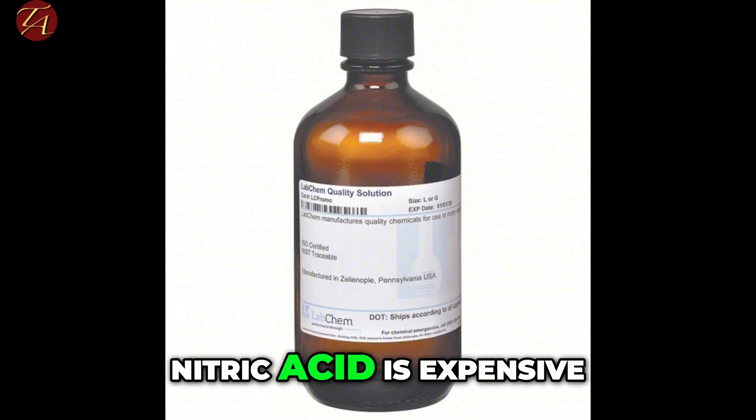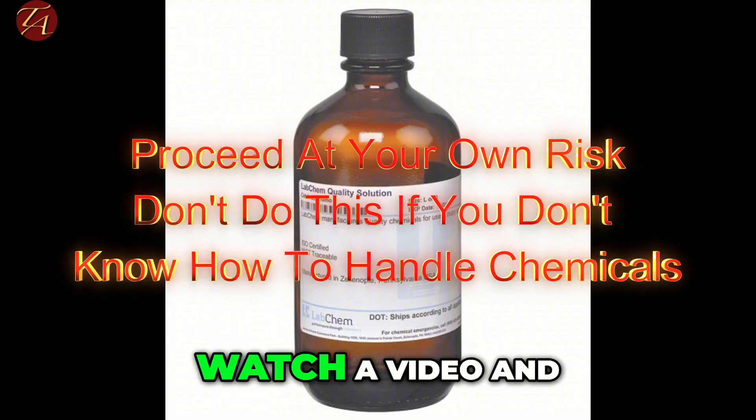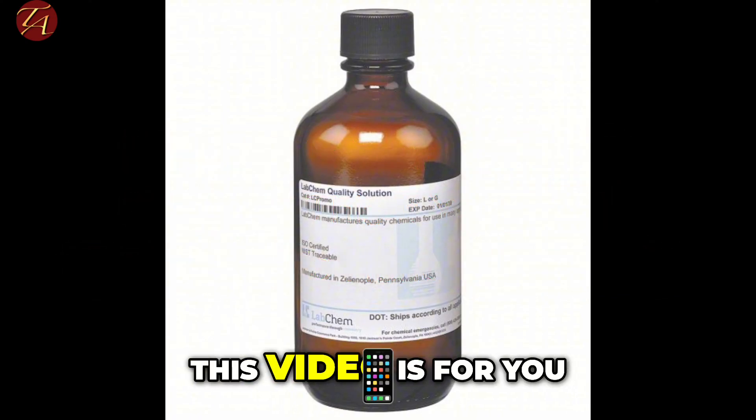Let's face it, nitric acid is expensive, but you can cheaply make it at home. If you want to watch a video on how to do it quickly without a lot of fluff, this video is for you.